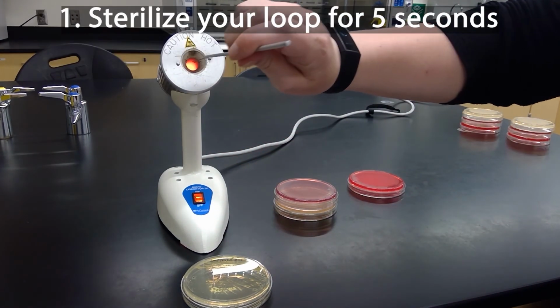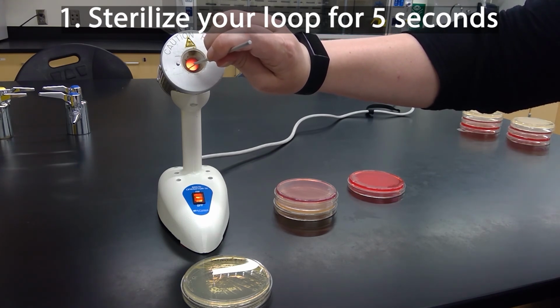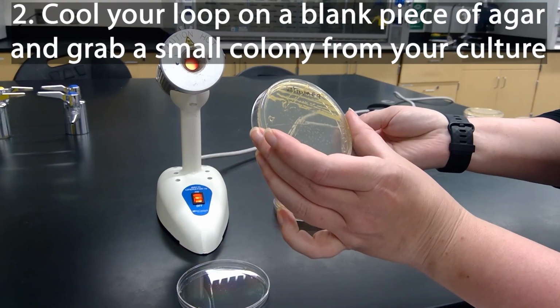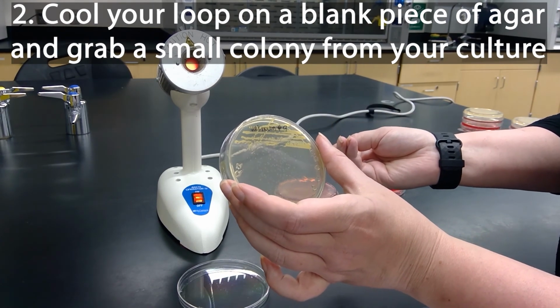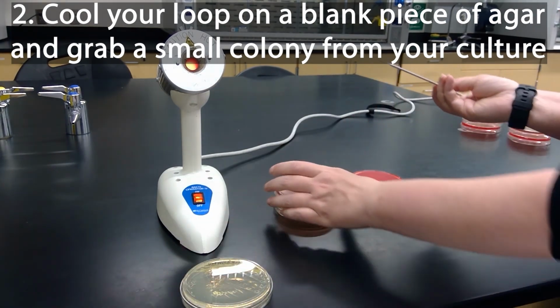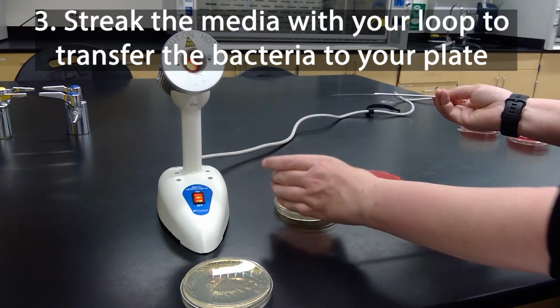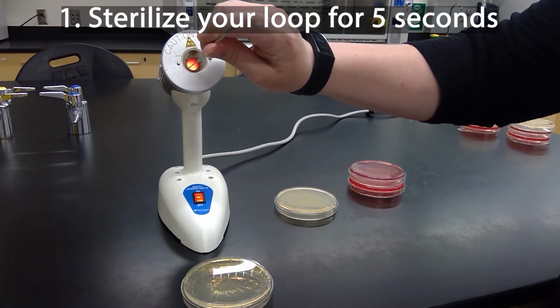And then sterilize our loop again. And then we'll grab some culture, streak it onto our plate, and then sterilize our loop again.